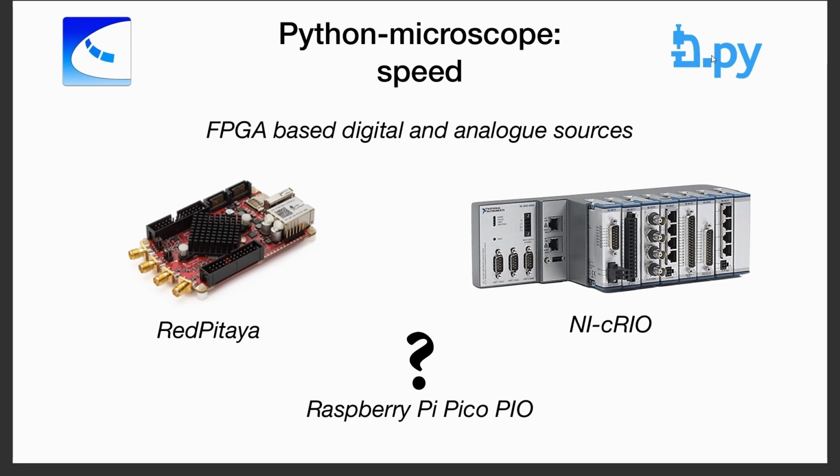It's a few thousand euros. Red Pitaya is 200-300 euros, so it's a much cheaper solution. The advantage of the National Instruments is that it's very good, and you can customize how many digital outputs, inputs, and how many analog inputs, outputs, with how many bits. You can really configure it as you want. And that gives us a lot of flexibility for very complex systems.